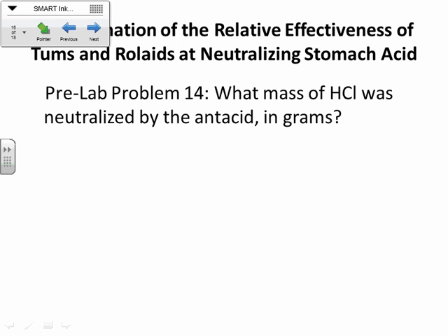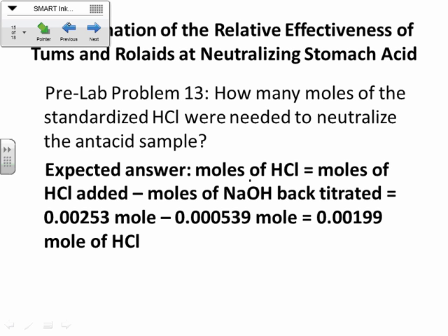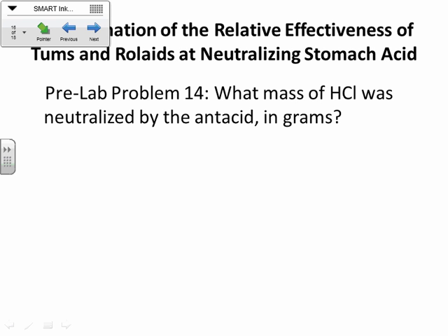Now, once we know the 0.00199 was the moles of HCl that were needed to neutralize the antacid sample, then we can figure out the mass of the HCl that was neutralized by the antacid in grams.